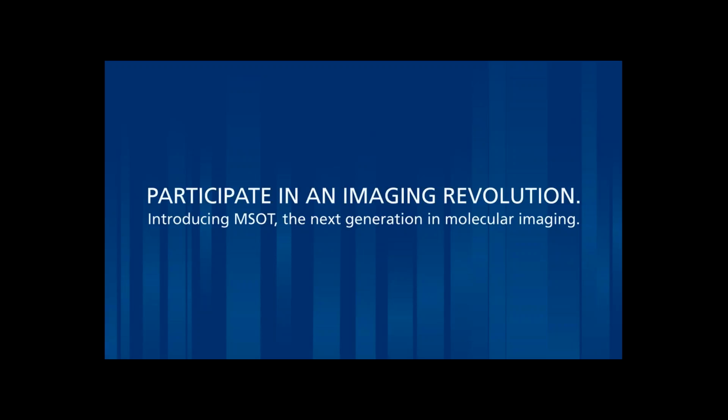Maybe first question for Neil. You have presented a lot of studies with mice. Is it also possible to image rats in the system? Thank you, Philip. Yes, it is possible to image rats. We didn't show any of this data today, although this is certainly possible.